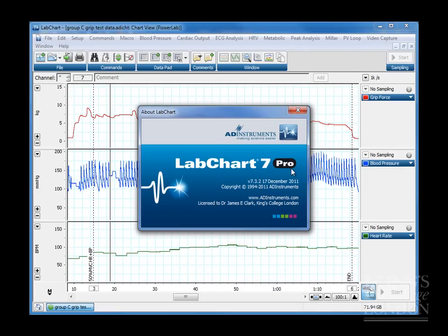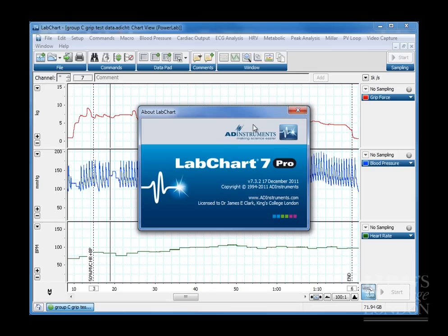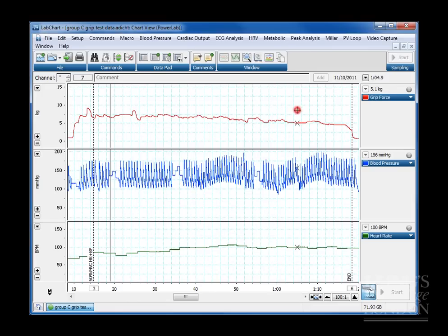This will allow me to do saving, which of course LabReader cannot do. So there'll be some important notes during this about getting your data into a program like Excel in order to do your analyses offline, without having to sit there at a PAWS machine with LabChart open for the rest of the week. So there's LabChart Pro that I'm using.